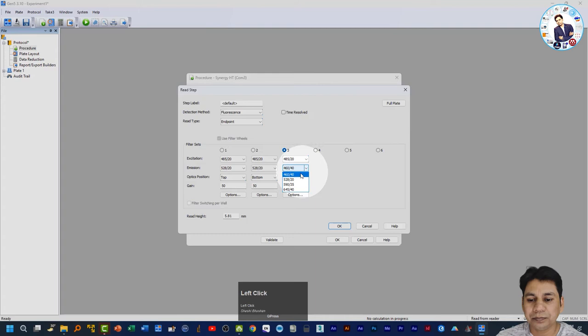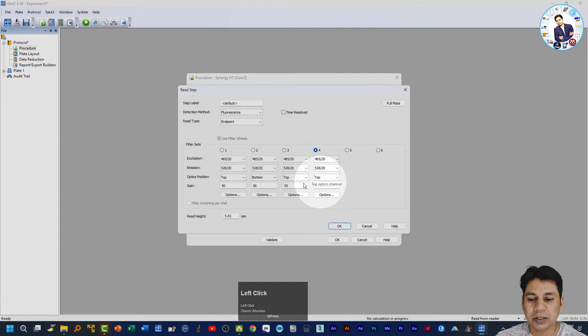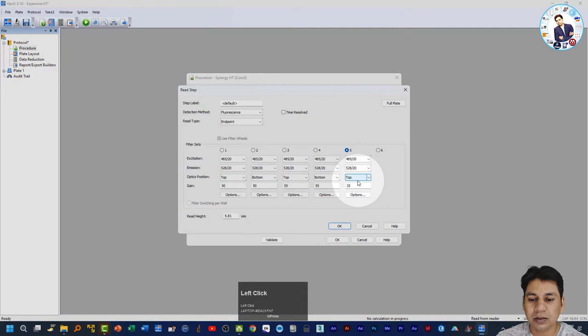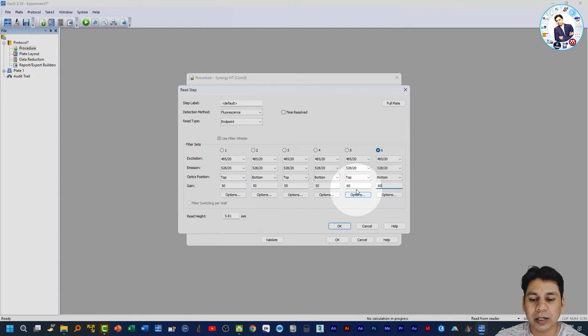For the third data set, I am selecting the top optic position and changing the gain from 50 to 55, with the same excitation and emission. Next, I select bottom optic position with gain 55. Then I add another setting with gain 60, and another with bottom optic position and gain 60. So in total I am using three different gain values — 50, 55, and 60 — with both top and bottom optic positions for each.